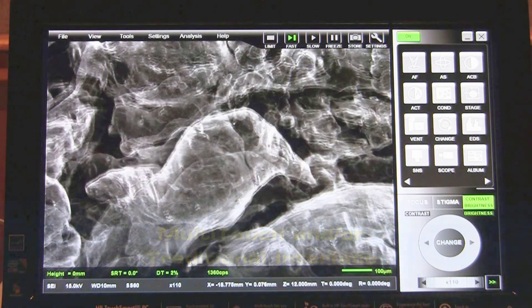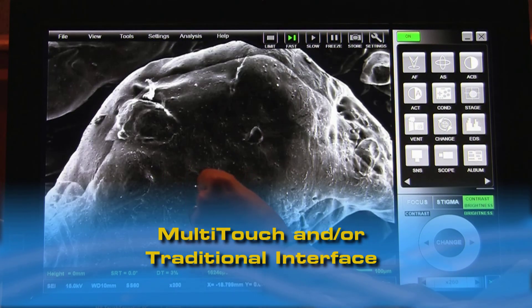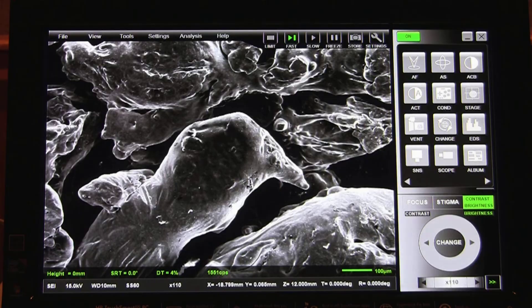The multi-touch screen interface makes it easy to expand areas of interest, focus, and select operating parameters, analytical functions, or measure areas.